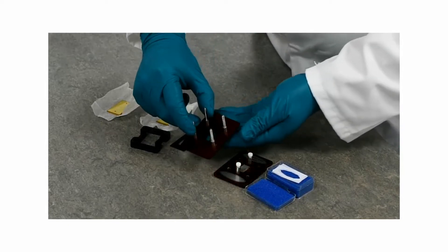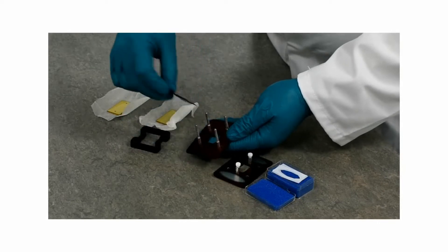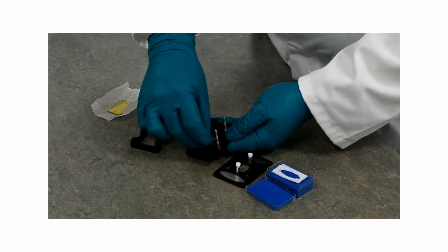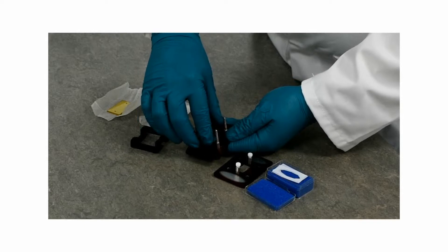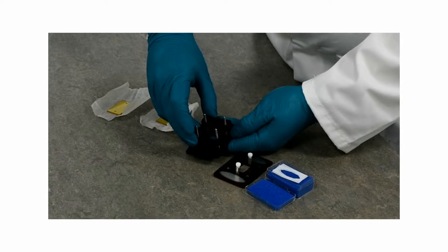To start assembling your omni-cell you have a back plate, which you will find a rubber seal is normally already in place, and you have a spacer plastic band which just goes over the sides.